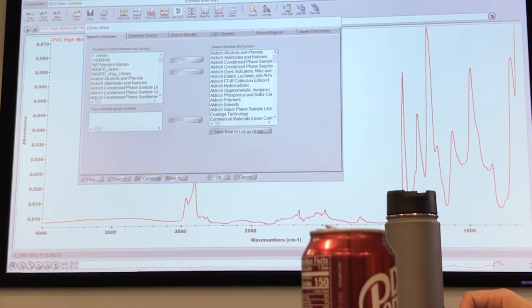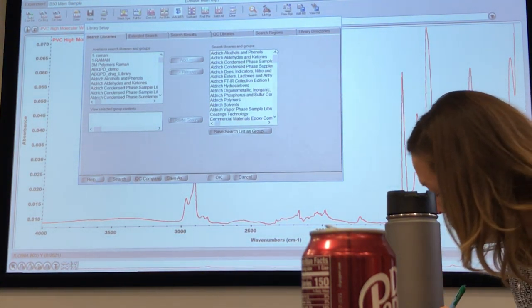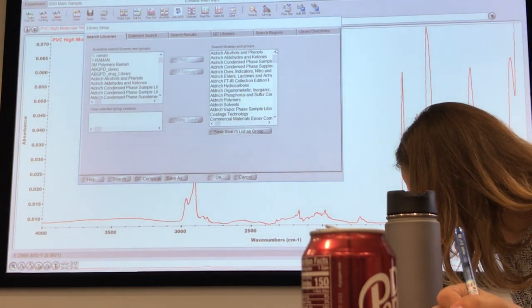I'd like to add a comment. I made an open access tool for analyzing spectral identification. So if you have reference spectra, you could share them with me, and I'll share them with everybody else. Oh, that's awesome. That's a great tool. So it's open access, like anybody among us can use it? Yeah, if you want the website, I'll give it to you too. Yeah, please send it to us too. I'd love to get your input.